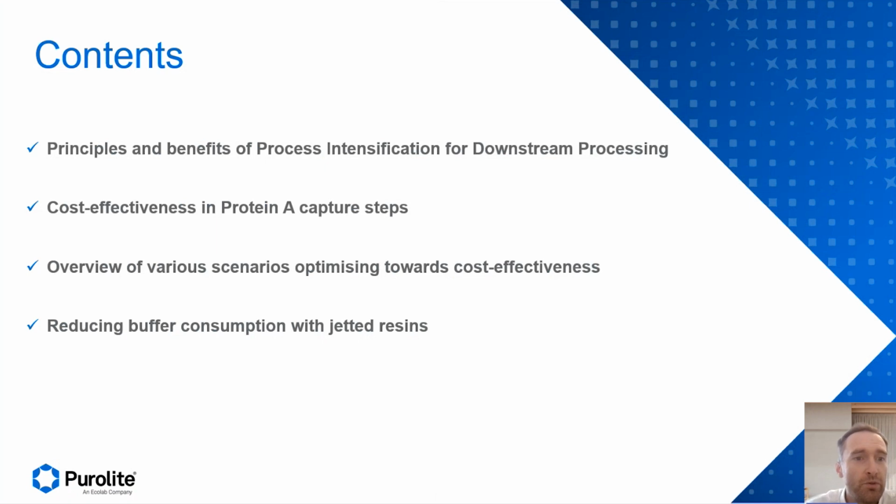I'll be covering the principles and benefits of process intensification for downstream processing. I'll cover the cost effectiveness in Protein A capture steps. I'll provide an overview of various scenarios, optimizing towards cost effectiveness. And I'll talk about reductions in buffer consumption using Purolite's jetted beads.